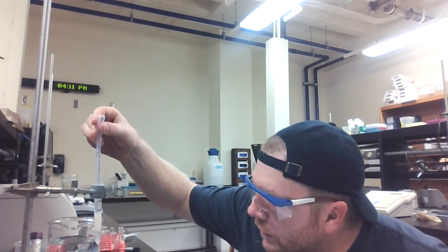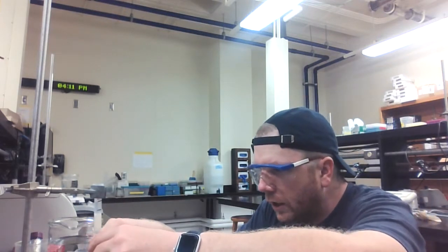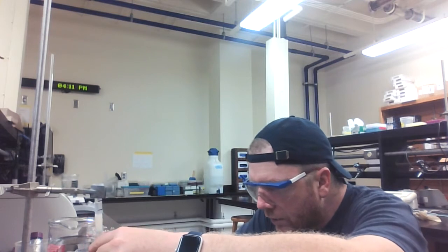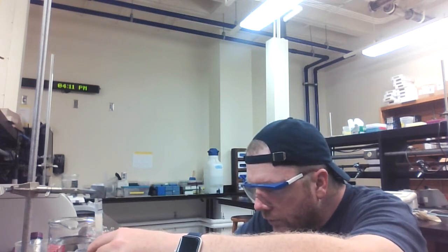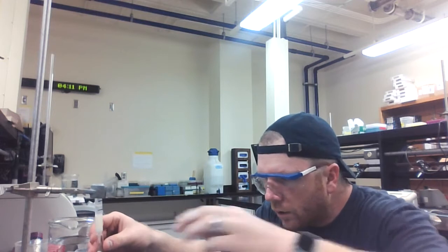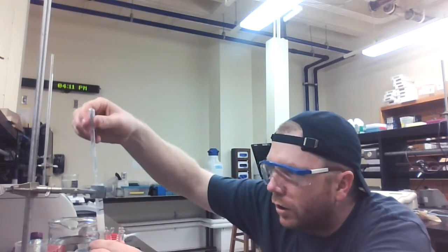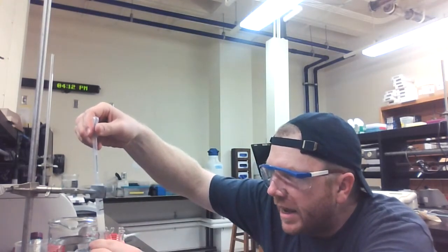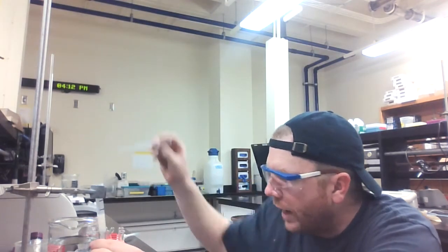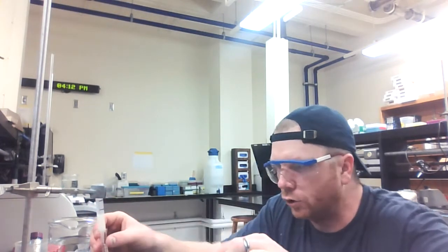I'm doing this oh so carefully so that I don't disrupt the resin, and I'm going to collect 5 fractions. One, 2, and this would be like the third milliliter basically to come off of my column. This is where I'm beginning to think that maybe, just maybe, I'm getting some of the proteins that were adhering to the column. They're beginning to feel the impact of that sodium chloride within that elution buffer. Okay, so it's continuing to go. Looks like I'll be able to get 2 fractions out of this.